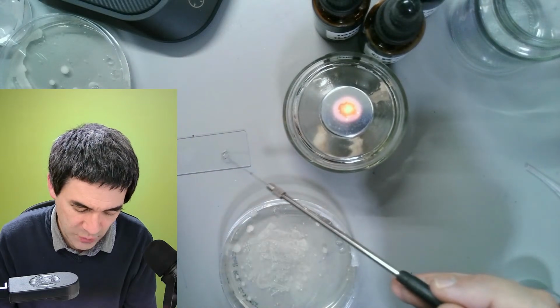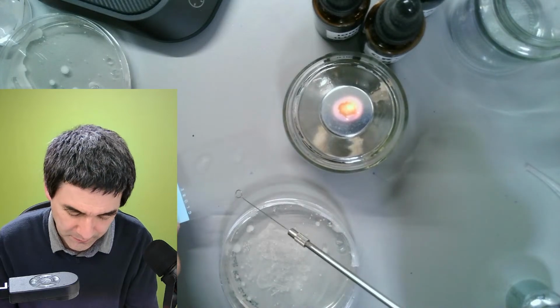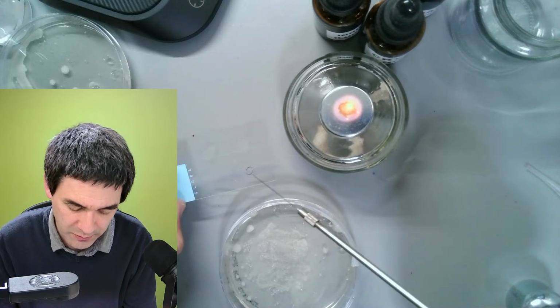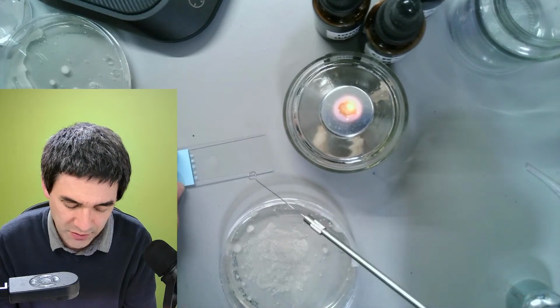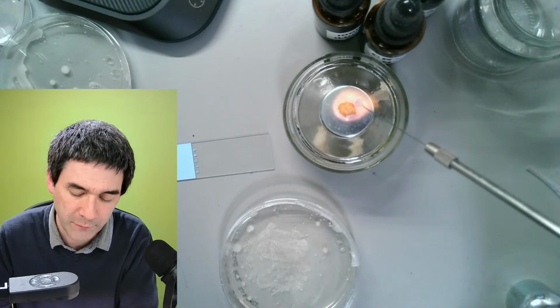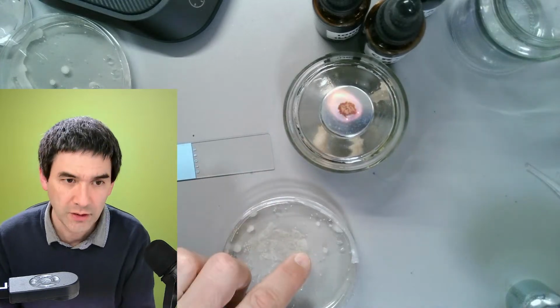The medium is so bad that there seem to be also cells present right now. What we might want to do is quickly put it under the microscope for a quick check. Okay, so that's basically finished. This one is closed again.